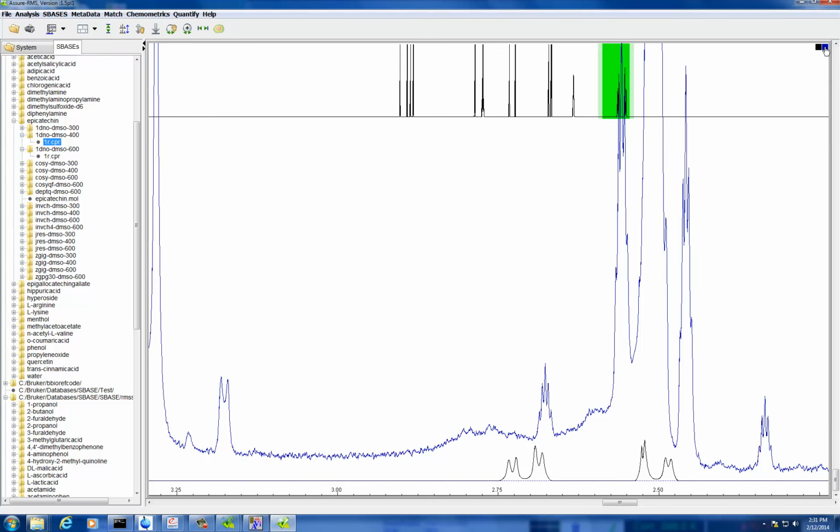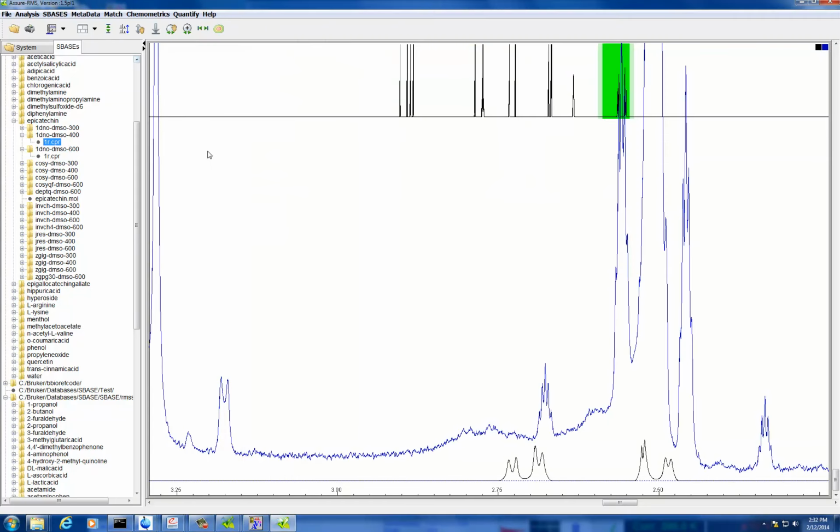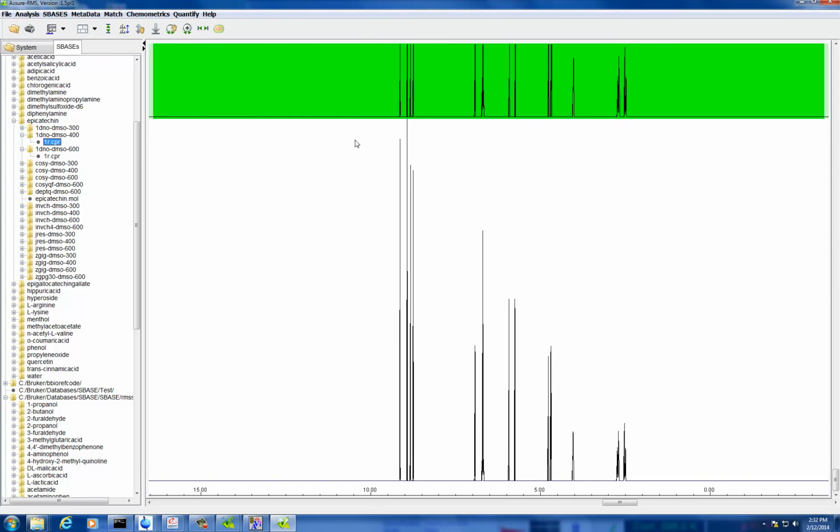How do you do that? Can I? Yeah, for sure. Play around with it. So can I start from here? Is this one R, right? Yeah. So let's close that. Right click, close. So now everything's closed. You want to compare this compound? Take that and drag it into the window. Now it's open.